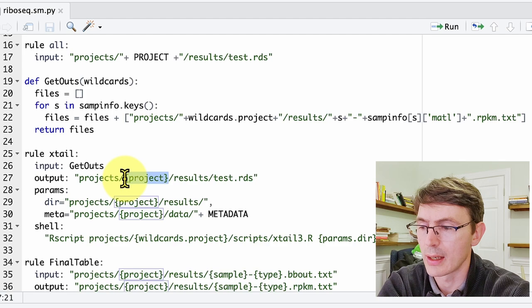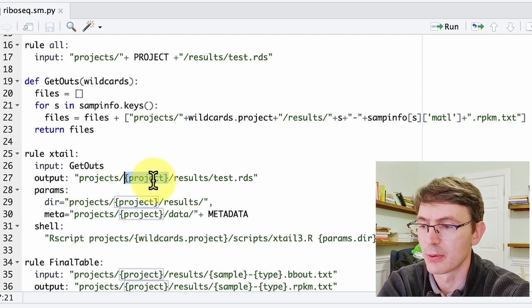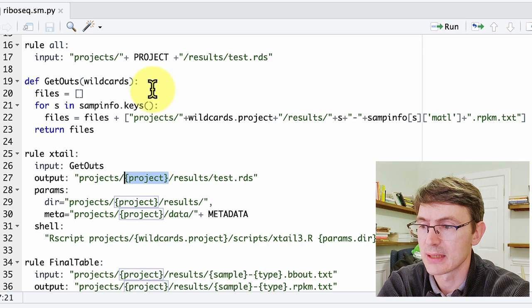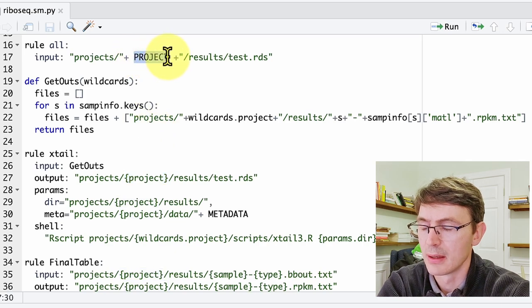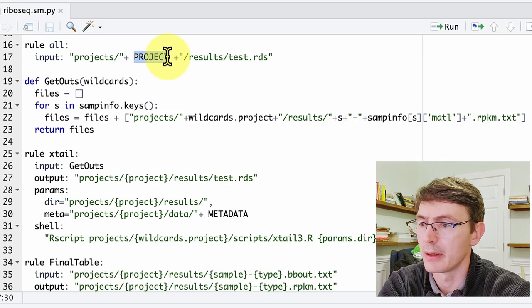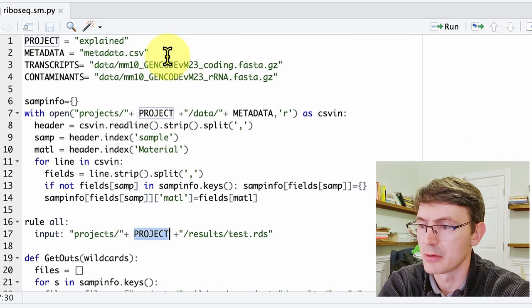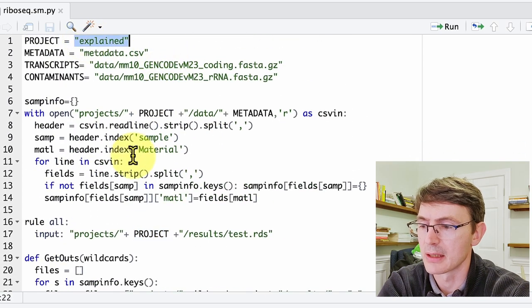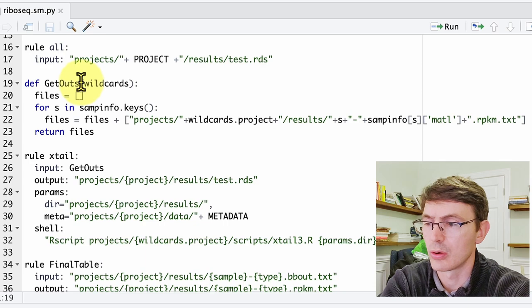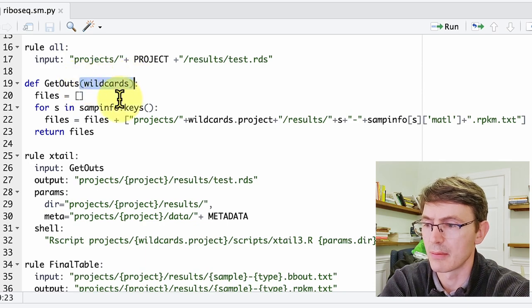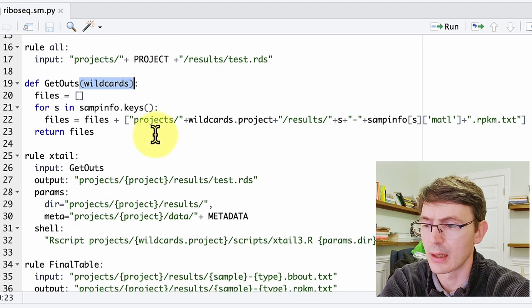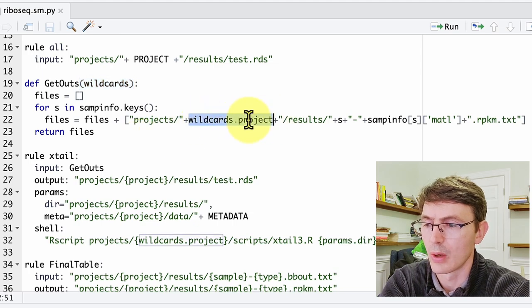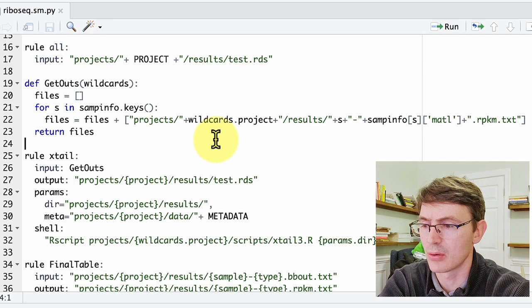And what Snakemake will do is define this 'project' wildcard and assign this the value of this 'project' variable that is a normal variable, if you want, that we defined previously and that has the name 'explained'. So going back to the function, all the wildcards are passed together within this main variable, and to access the project wildcard we have to use the notation wildcards.project. And as you see, this is the only wildcard generated here or defined by rule all.